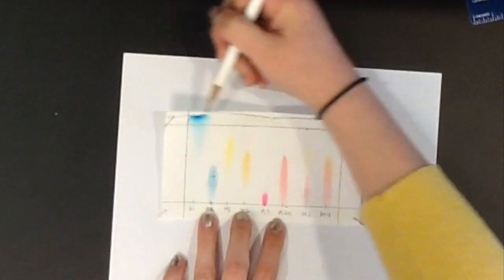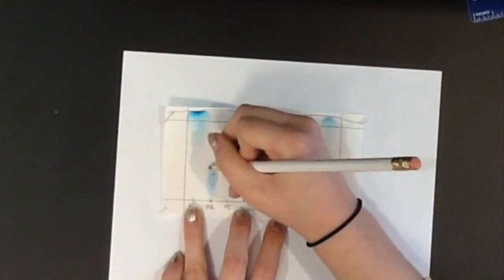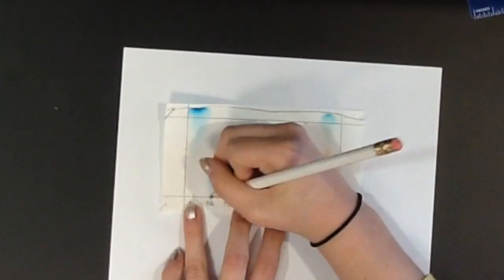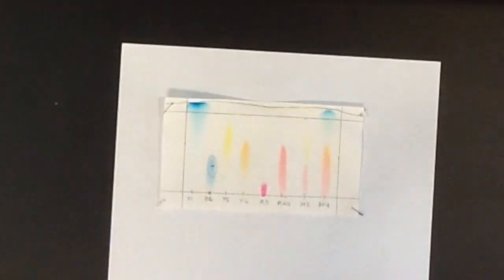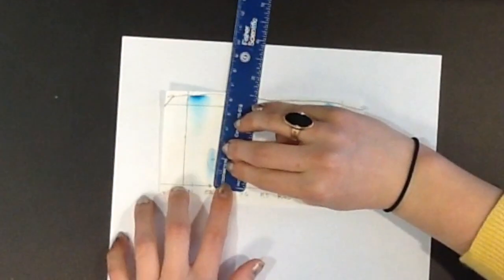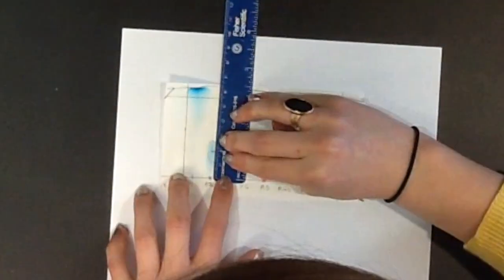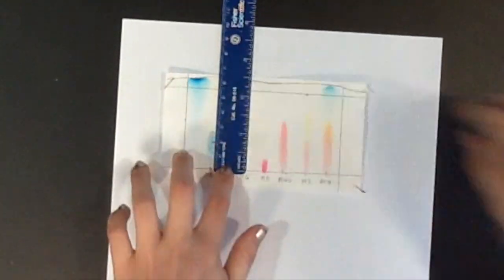For reference, this top line is the solvent front. Now we can measure for RF. Measure from the origin to the middle of the oval. This is the distance traveled by the sample. The value for this is 1.85 cm.